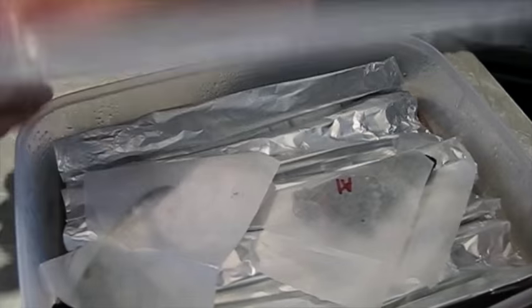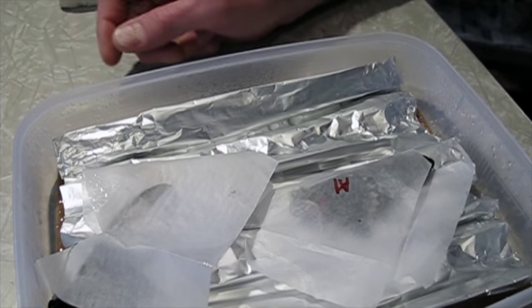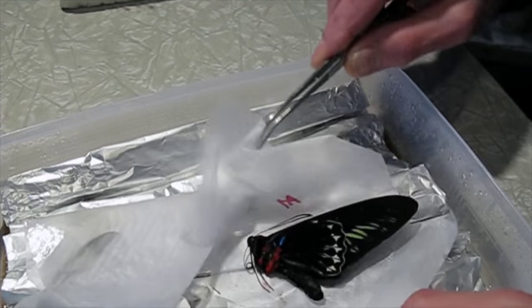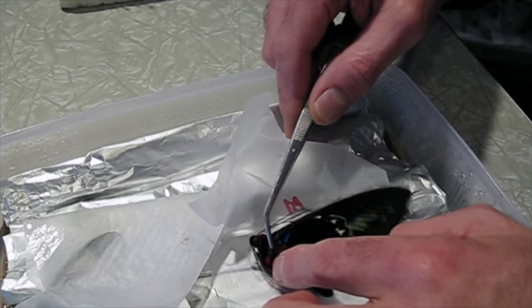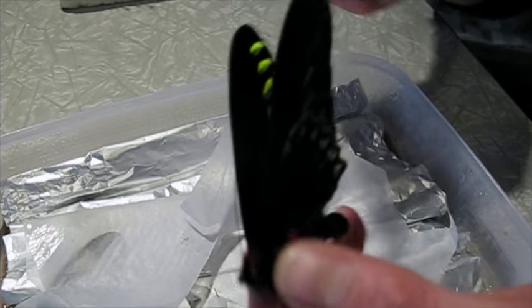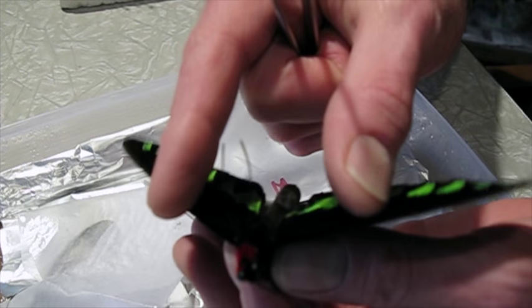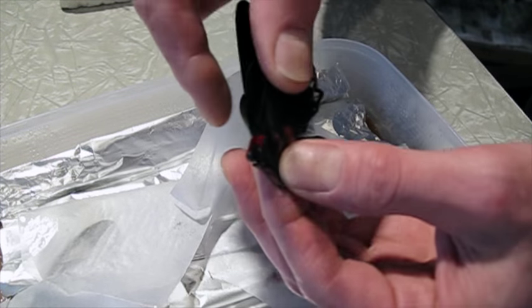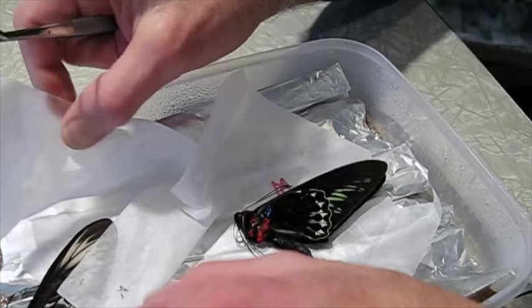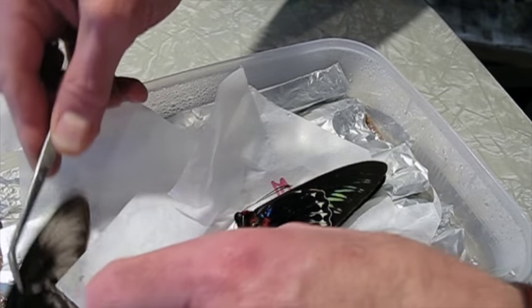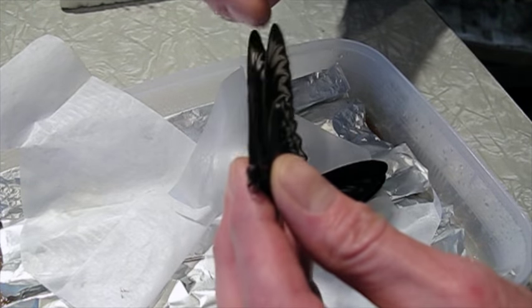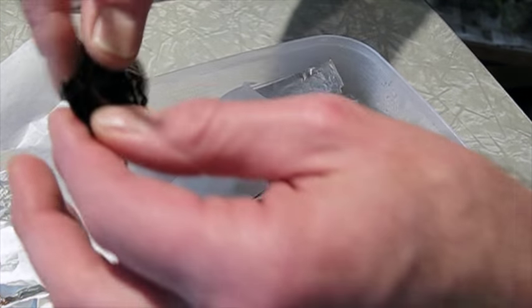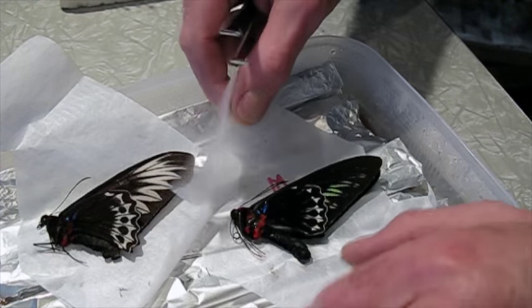Now these specimens have been relaxing for a day and we'll see how they look. Oh yeah, the wings are very soft. You want them nice and soft and flexible. If they're stiff, just put them back and let them go a little bit longer. This is the female. Very nice, this is perfect. Let's start with the male.